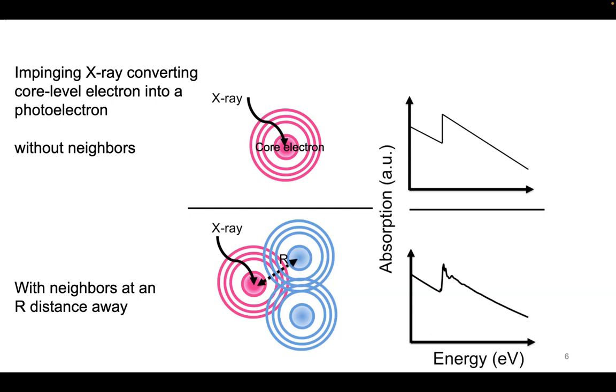So what we really want to understand from all of the signal in terms of the X-ray interaction with that of all these core electrons is, well, one, what type of neighbors you have, and also where the neighbors are, and how they affect the signal. Okay, and just by looking at the near edge region right here, we can get a lot of information already before we do any Fourier transform or any modeling. We can understand a lot already.